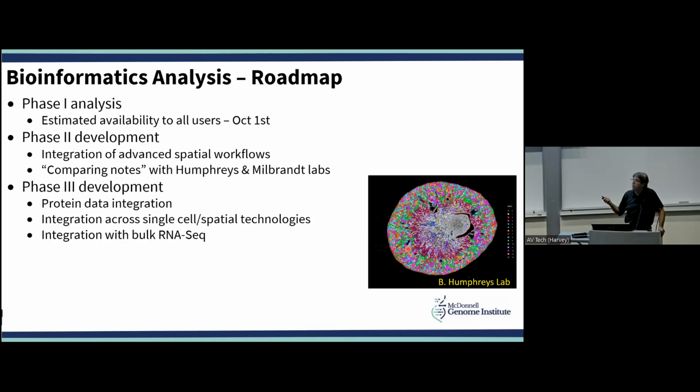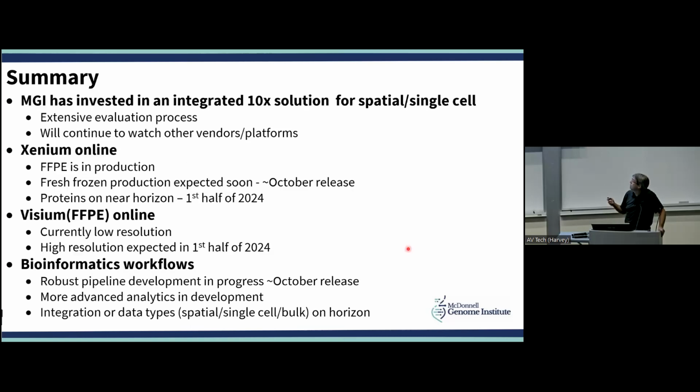So as you can see, we're putting a lot of effort into the bioinformatics analysis. So, a summary of all of this. As you've seen, we've made a pretty substantial investment in the 10X platforms. That's not to say we're not going to keep our eyes on other stuff. We're absolutely going to keep our eyes on other platforms. We're not married to 10X by any stretch of the imagination. So if there are things that come out, we will look at those.